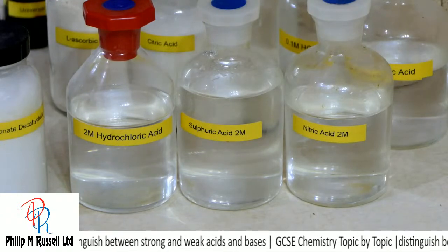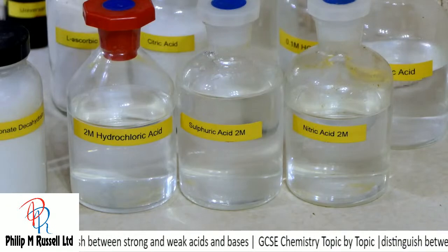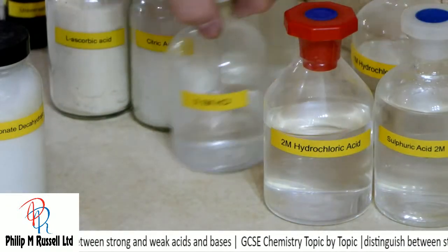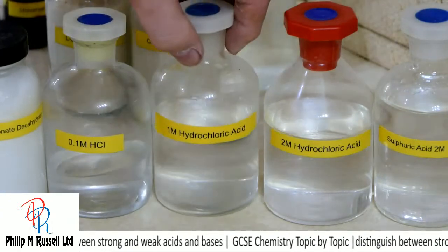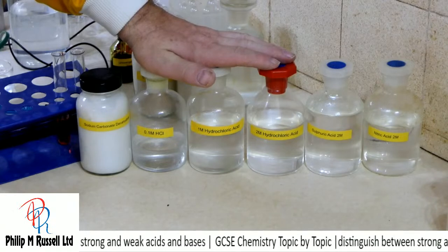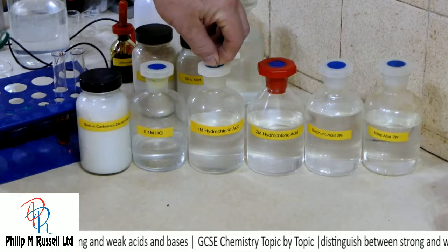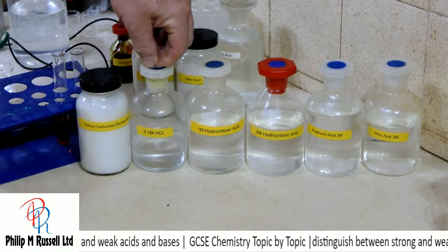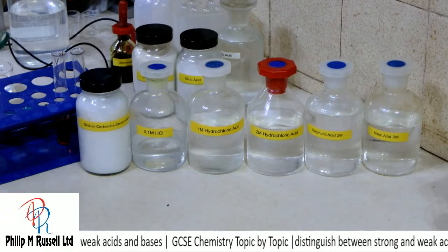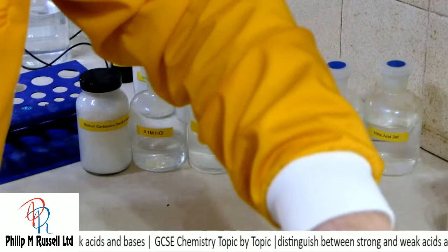We might be able to see a difference between the different acids. And then we're going to try the same reaction but with these three acids at 2 molar, 1 molar, see if it makes any difference, and 0.1 molar, see if a tenth makes any difference. So we'll have a go at those experiments.